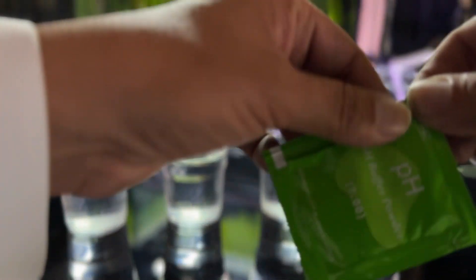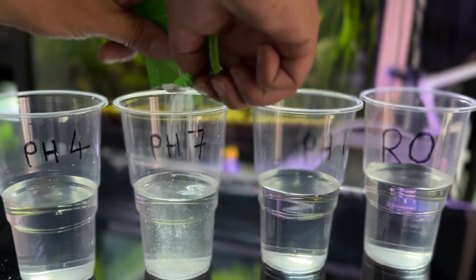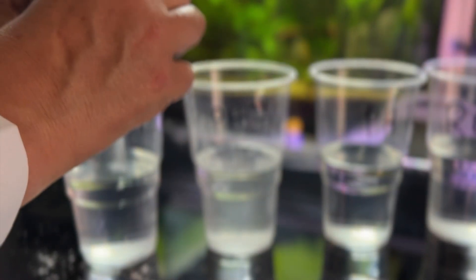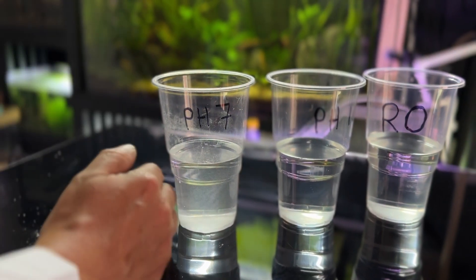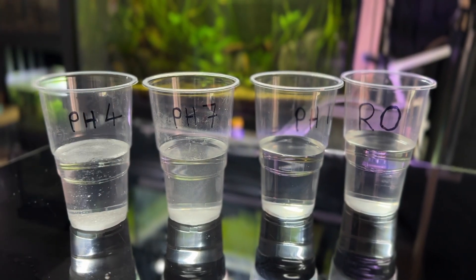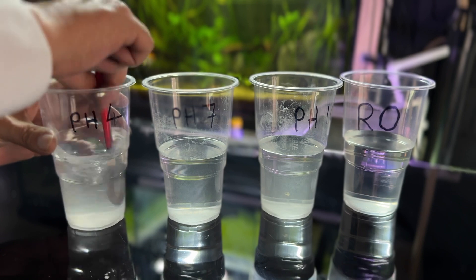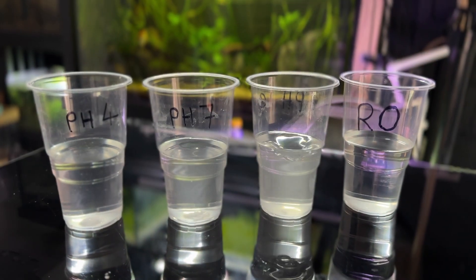I'll add these sachets to each one — pH 7, pH 4, and pH 10. Give them all a stir. I'm drying the spoon in between each one, and we'll let them dissolve.